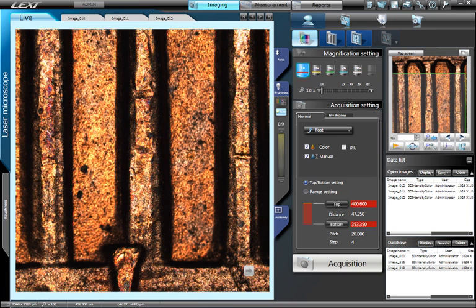First, ensure that you are in imaging mode and select the color camera. At the lowest magnification, use the joystick to pan around your sample and find a feature of interest.